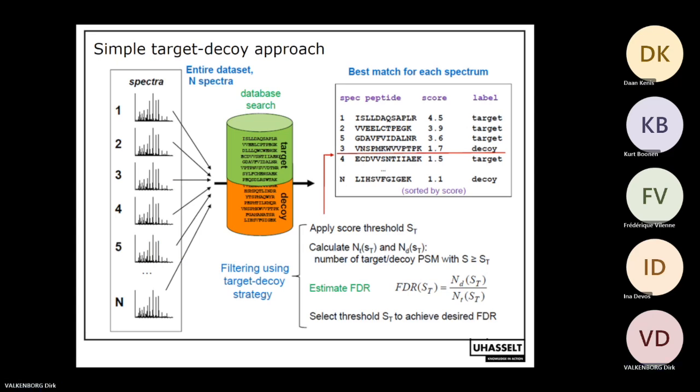So how could we actually distinguish a true from a false identification? This method is almost always used in database search engines, and it's called a target-decoy approach. What we will try to do is to get an idea about the null hypothesis: how would a spectrum match on a random candidate peptide?